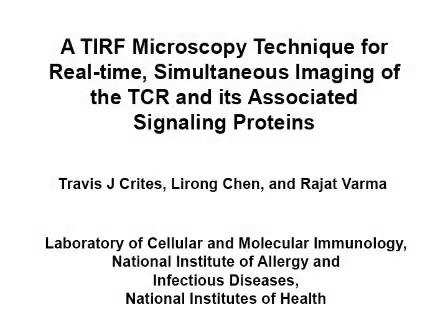This video describes a procedure for tracking T-cell receptor signaling events using dual-channel, simultaneous acquisition, total internal reflection fluorescence microscopy, or TIRF microscopy.